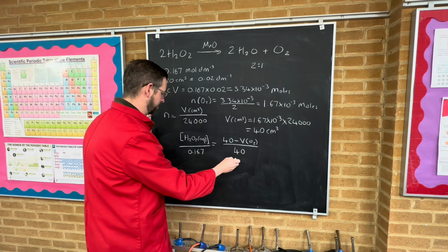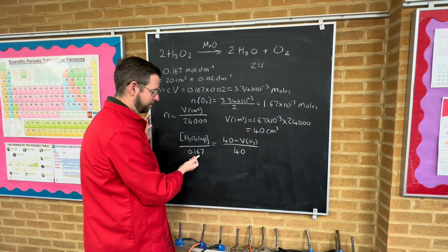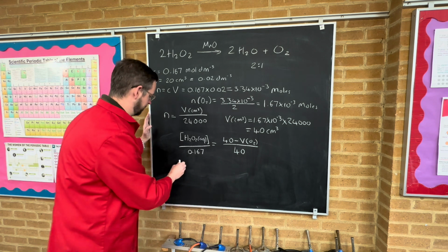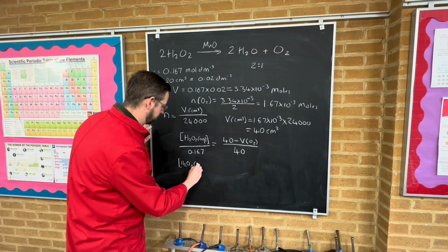So when that is equal to a half, then we know that the concentration would be half of what the concentration was to start with. That's how this works. So what I'm going to do is take the concentration by itself, the concentrations at any given point, the H2O2.